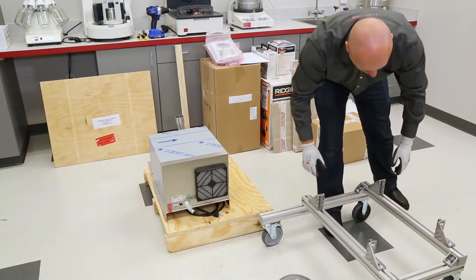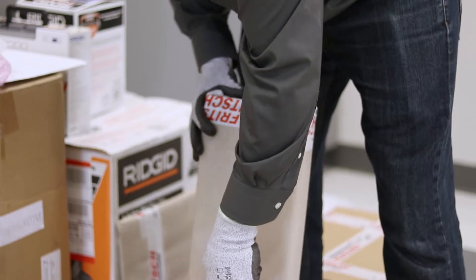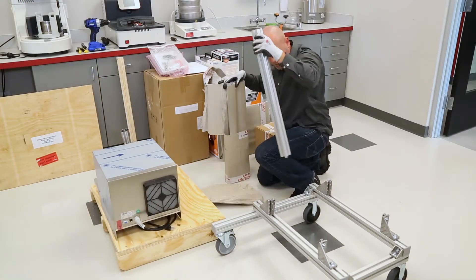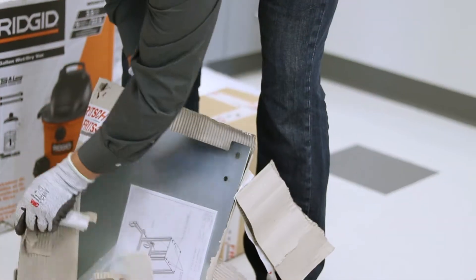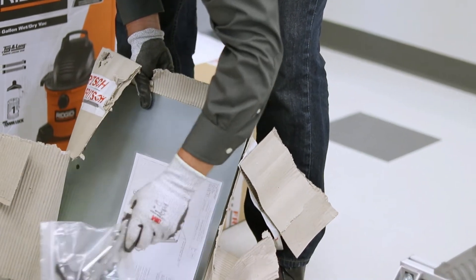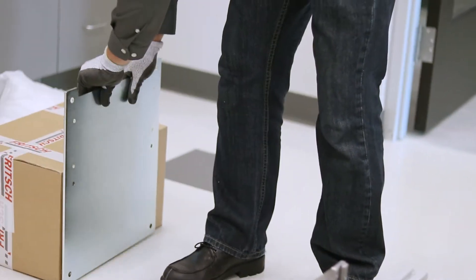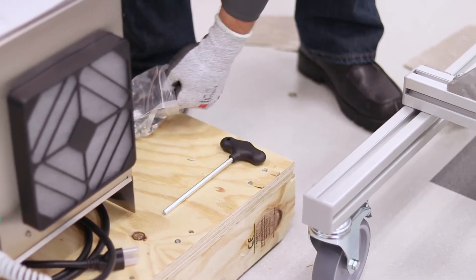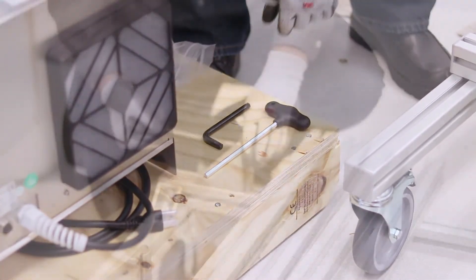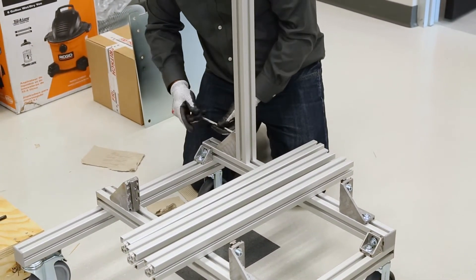Assemble the stand for the P19 mill. First, remove the four aluminum legs and top plate of the stand. Then loosen the screws on the mounting brackets and, one at a time, slide each leg down over the mounting bracket and re-tighten the screws.